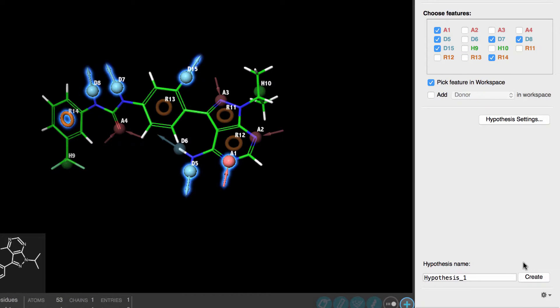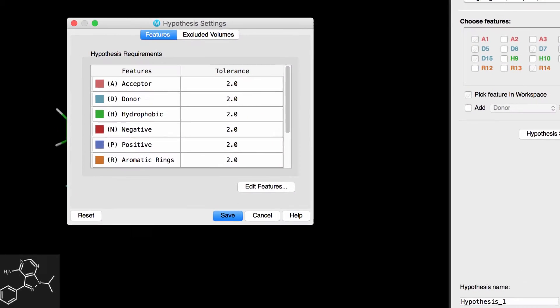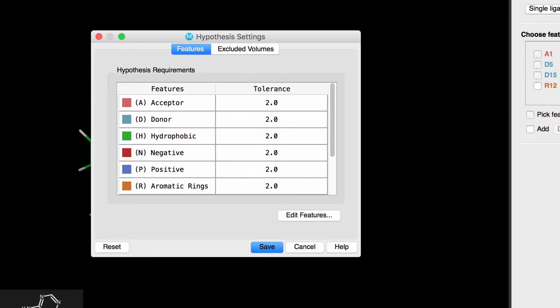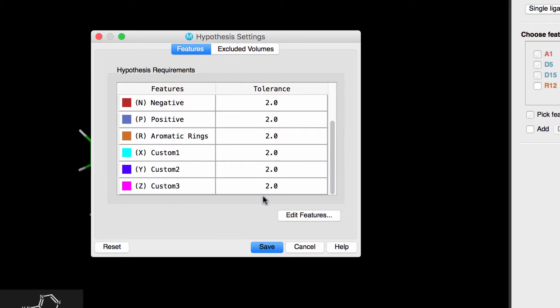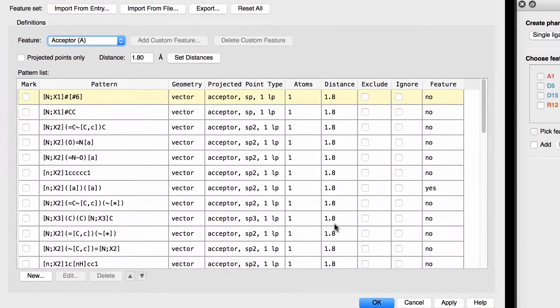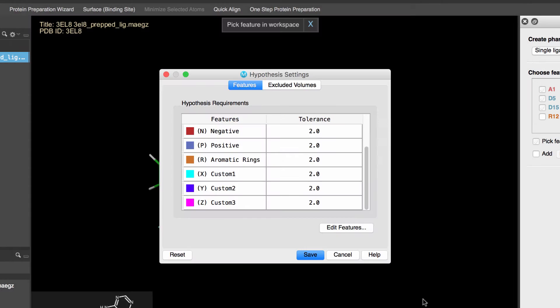Now that we've selected the features, we can click Create, but before we do that, there are some other optional hypothesis settings we can set. Here, we can adjust the tolerance radii of each type of feature, as well as employ custom features or access advanced feature editing capabilities.